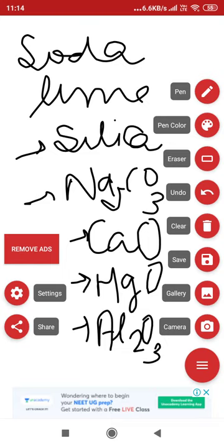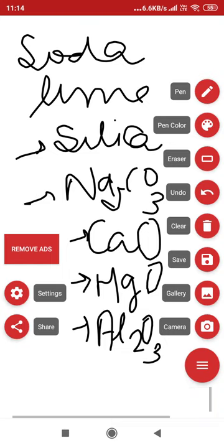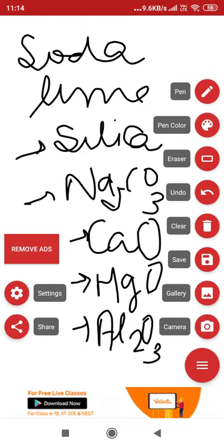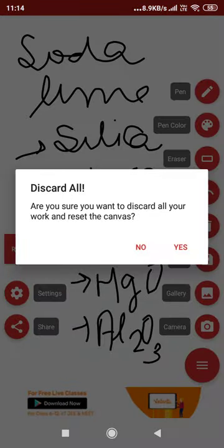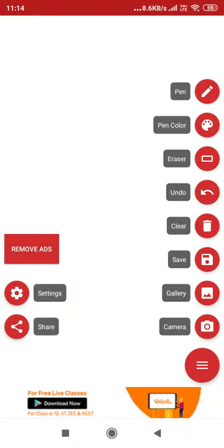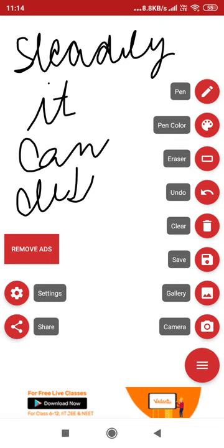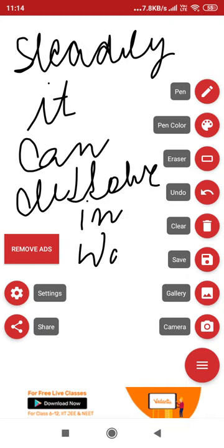And most of our laboratory glassware is made from soda lime glass because it is easy to heat up and more stable as compared to silica glassware. But what is the problem with this glassware? Steadily, it can dissolve in water due to the presence of sodium.